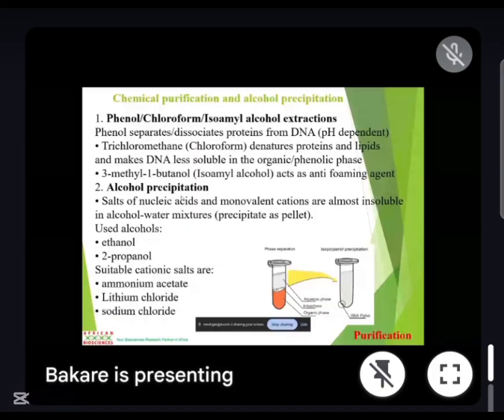I'm lysing first. So even if you are new, maybe you have been working with a Zymo kit before, and then you find yourself somewhere that they are using a Norgen kit or Forgene, you will not be surprised, because you know that no matter what, I lyse first, then I precipitate. So even if the kit is saying they are using phenol for their precipitation, and the Zymo uses chloroform, you know that you are still on track. You know what you are doing.